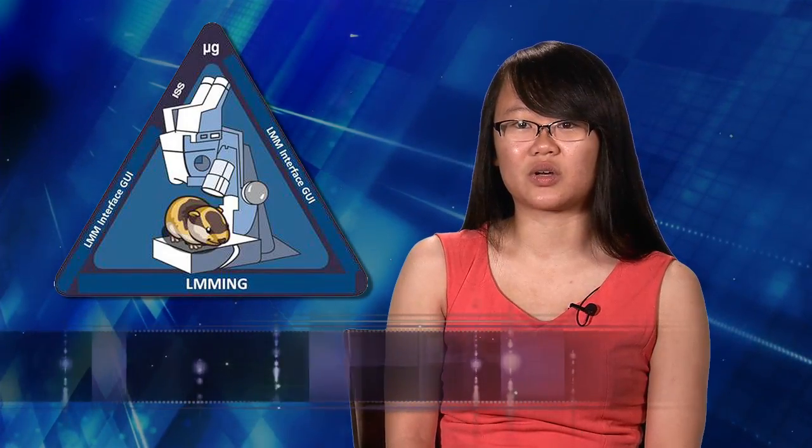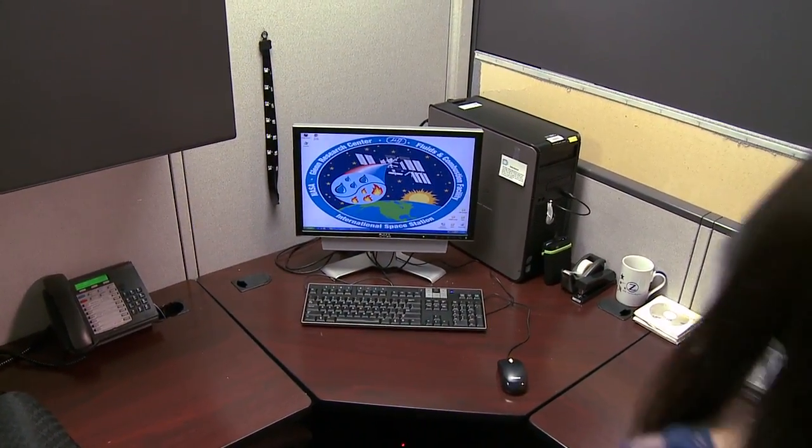This LMM tool helps scientists because before, scientists had to sift through the data. There were a lot of directories that they had to go through manually, and it took a lot of time and a lot of patience in order to look through it all. And even if they had the patience and the time, they might not have understood what they were looking at because it was raw data. So what Lemming does is it basically sifts through all the data for them so that they don't have to do it, and then it displays it discreetly on the screen.